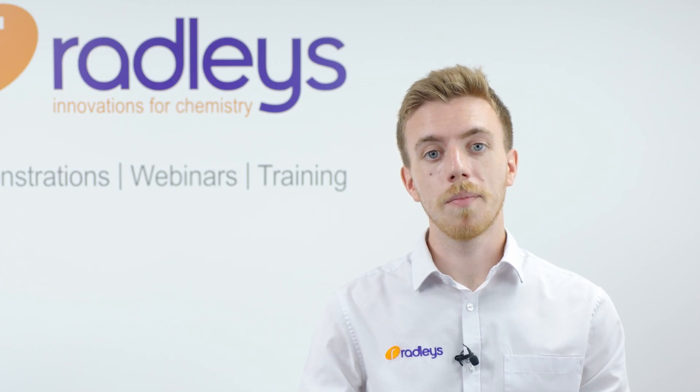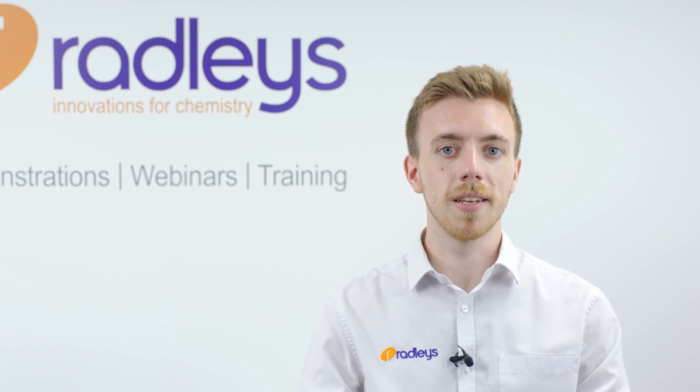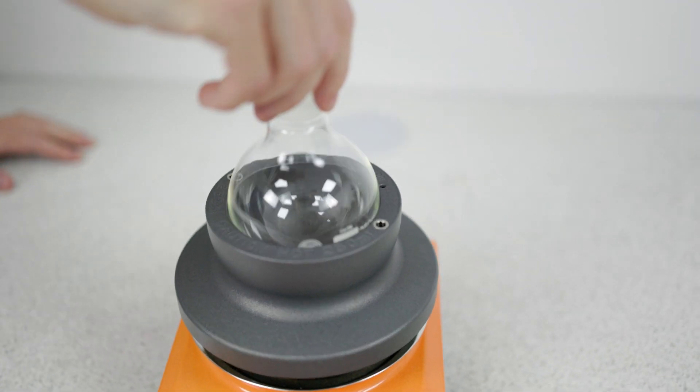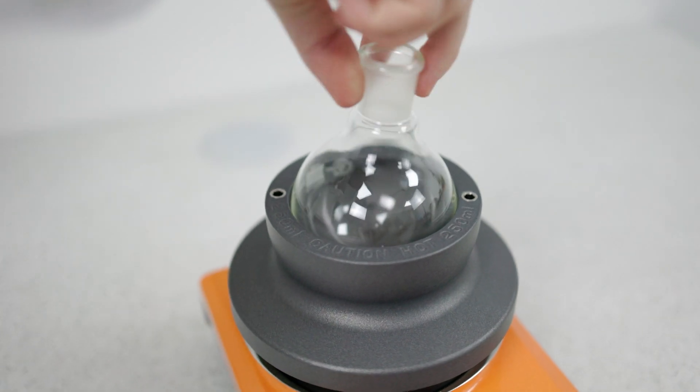This means you spend less time waiting for reactions to get up to temperature and you also waste much less electricity. Radleys' proprietary design ensures that flasks don't crack — they gauge the glassware as you put them in the block. If you can put the flask in and spin it, then it won't ever crack as the block cools down.